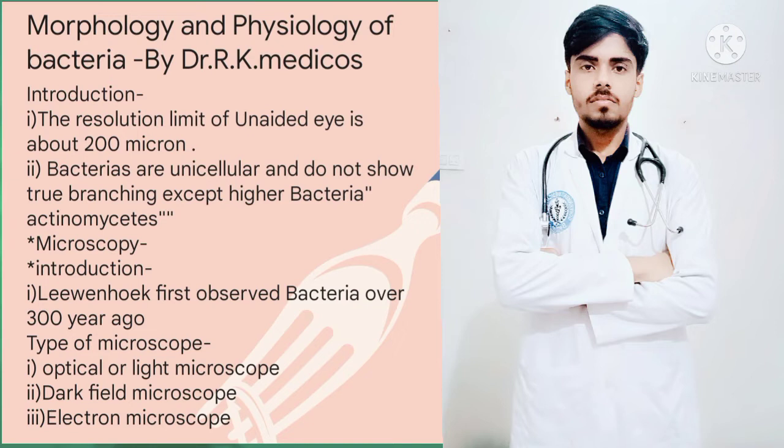Now we will discuss about microscopy. In introduction, you should remember that Leeuwenhoek first observed bacteria over 300 years ago. There are mainly three types of microscope: first is the optical or light microscope, dark field microscope, and electron microscope.